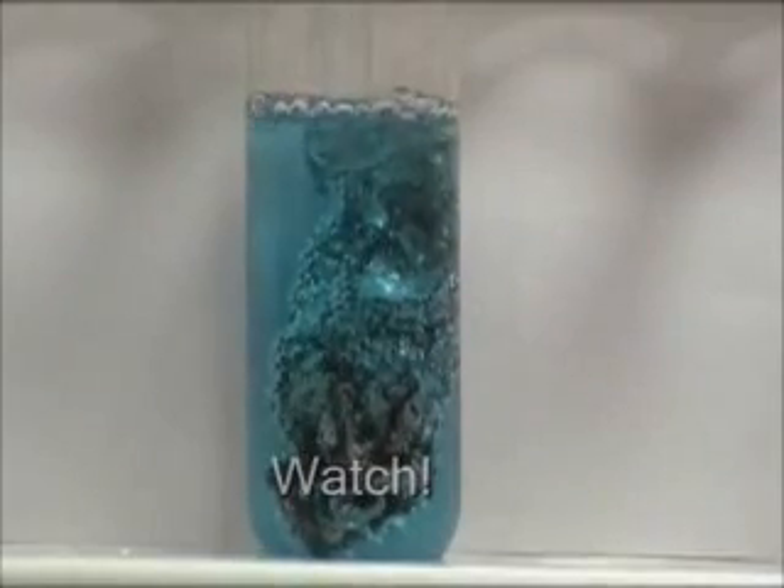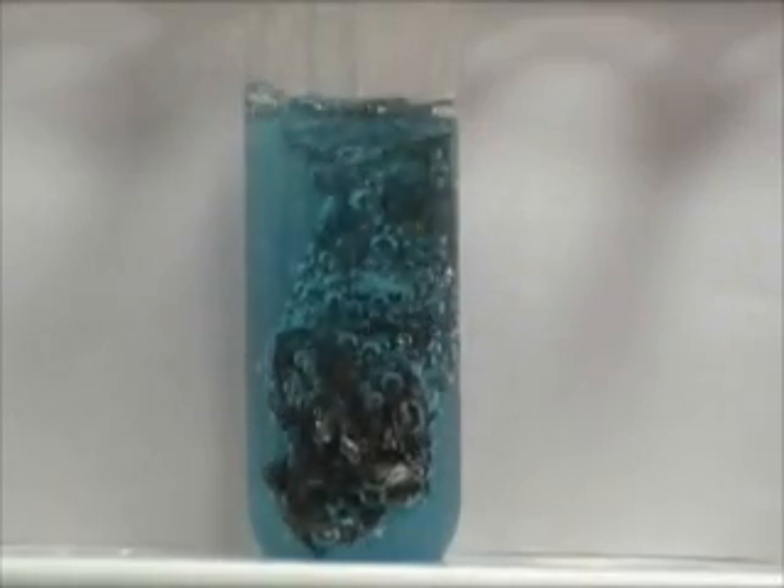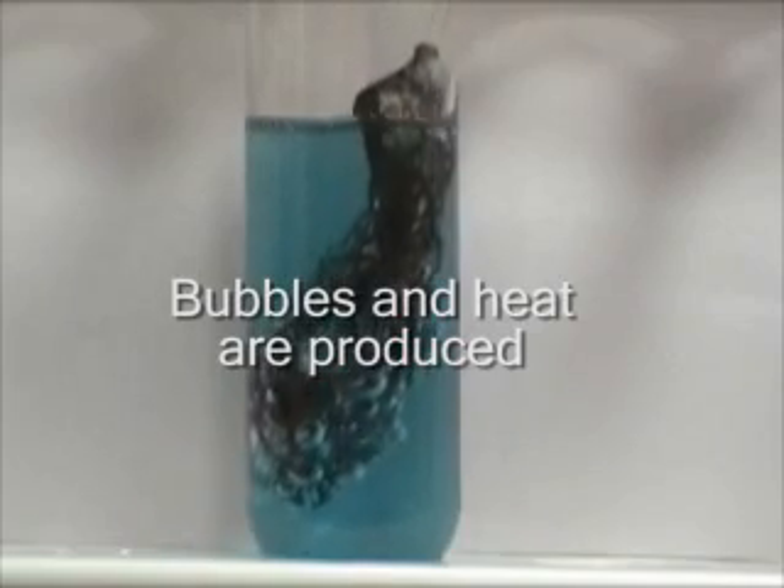The reaction should begin. Bubbles should form and heat is produced.